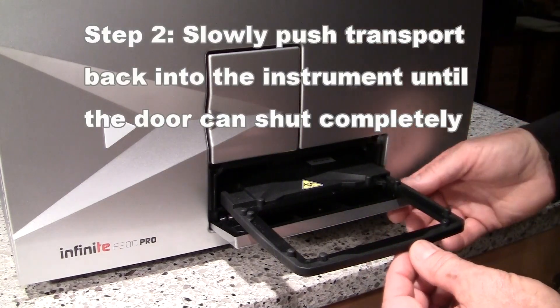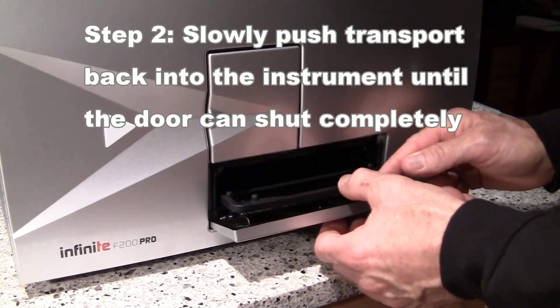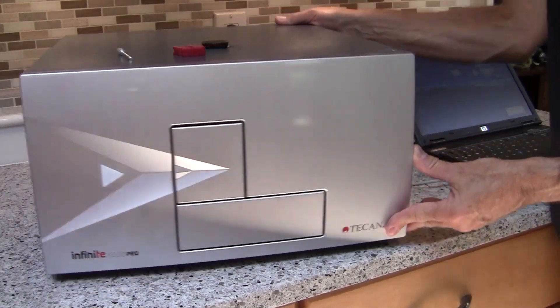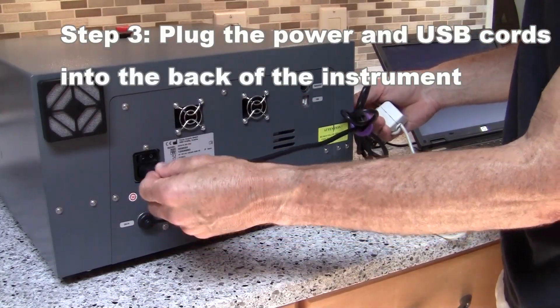The next step is to slowly push the plate transport back inside the instrument until the door can shut completely. Then turn it around and plug both the power cord and the USB cord into their respective ports.